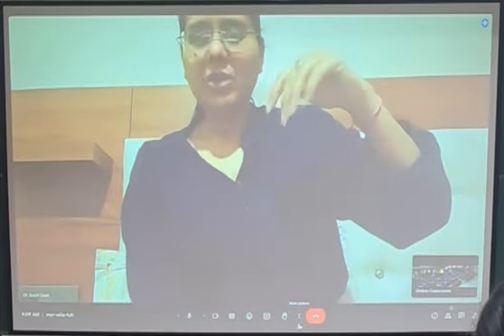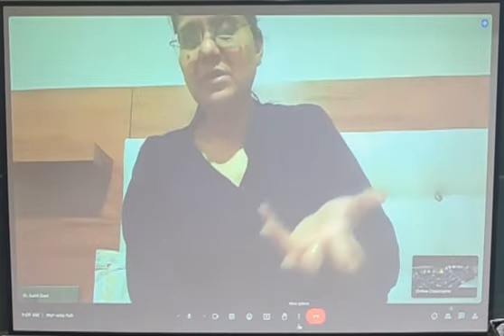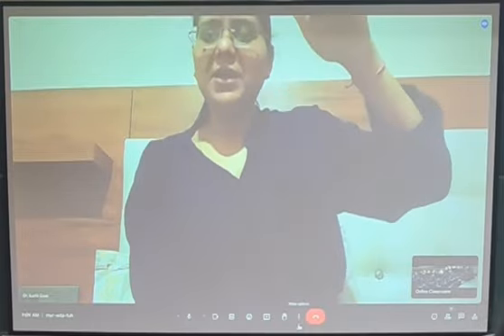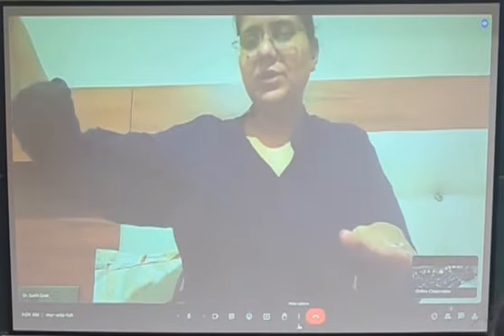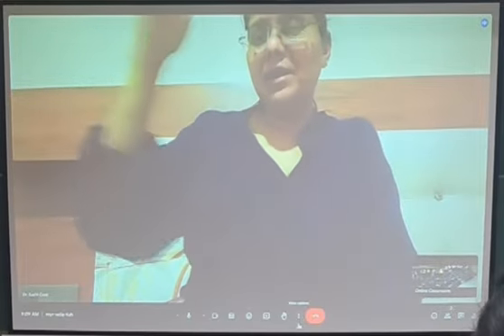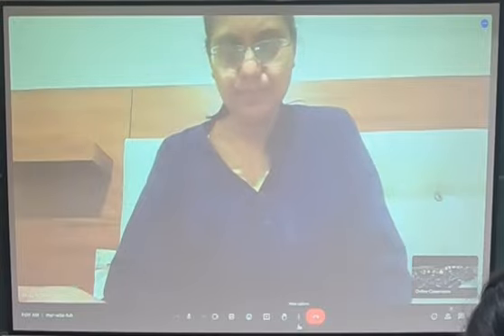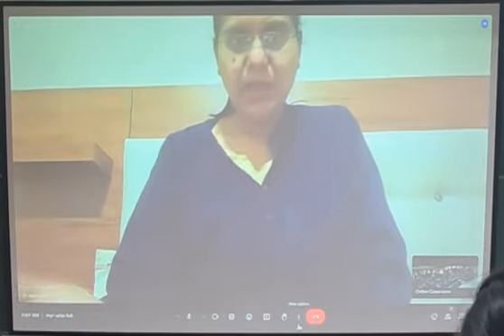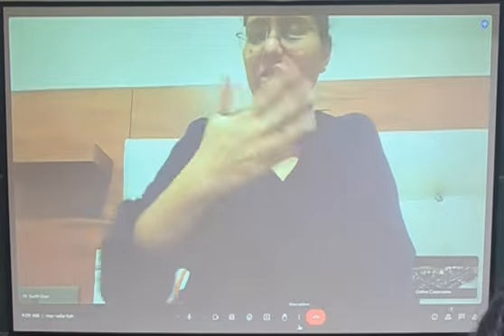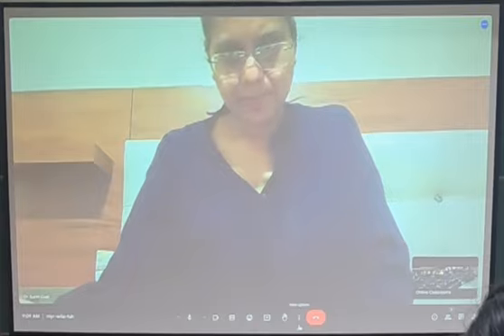Normally it's a very rough method, but it will tell you whether my bacterial growth has happened or not. For example, if you pellet your culture at 0.4, 0.8 and 3 OD, at 3 OD I will still get a good bacterial pellet as compared to 0.8 OD and 0.4. Do all of you agree with me? If I take 1 ml of your culture and pellet it down, the pellet at an OD of 0.4 will be smaller, 0.8 will be more, and 3 will be higher.